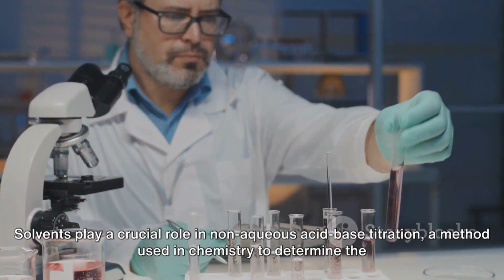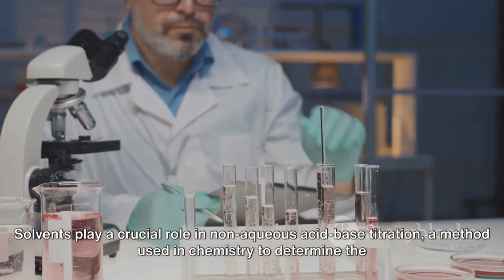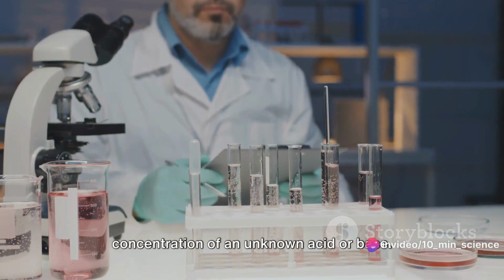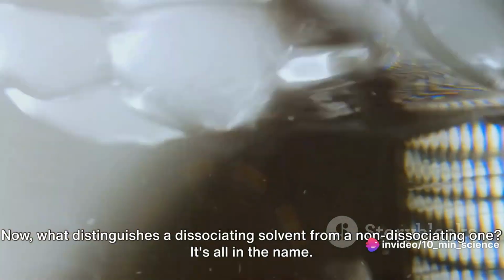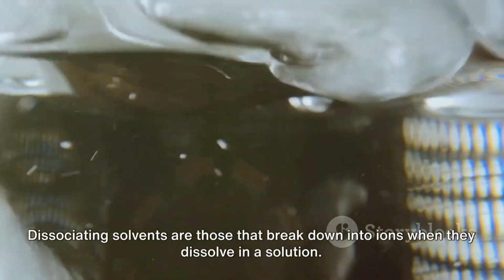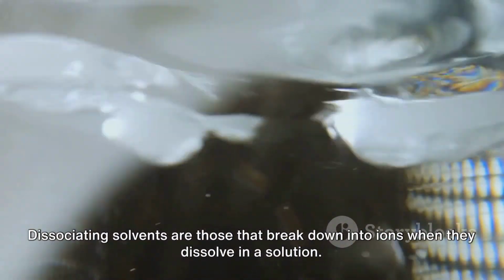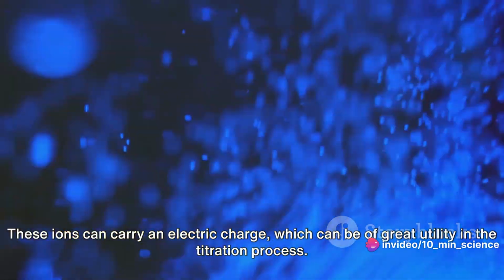Solvents play a crucial role in non-aqueous acid-base titration, a method used in chemistry to determine the concentration of an unknown acid or base. Now, what distinguishes a dissociating solvent from a non-dissociating one? It's all in the name. Dissociating solvents are those that break down into ions when they dissolve in a solution. This is a process called ionization.